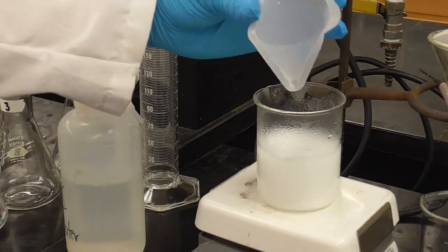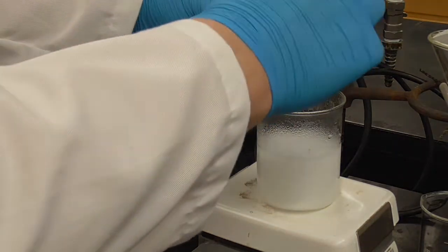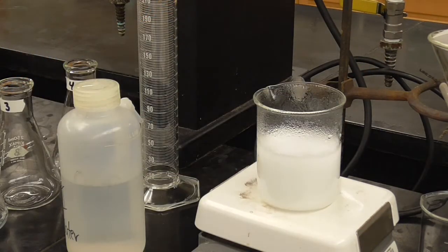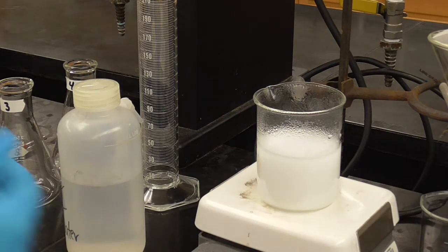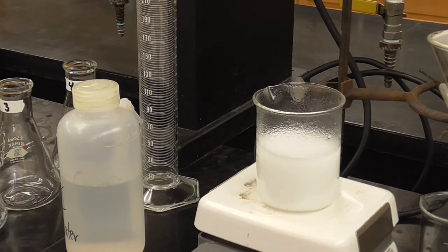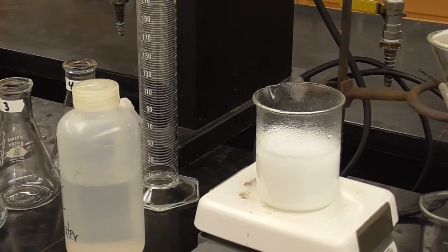So we're making a saturated solution here at a high temperature. Just get it stirring here. Okay, take a little bit. Okay, so we'll tune in again in about 5 minutes from now, after this has boiled for 5 minutes.